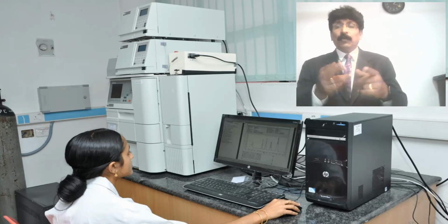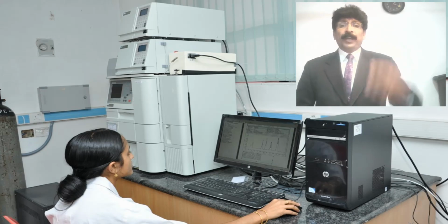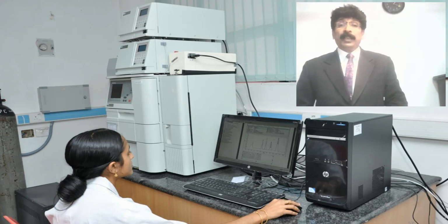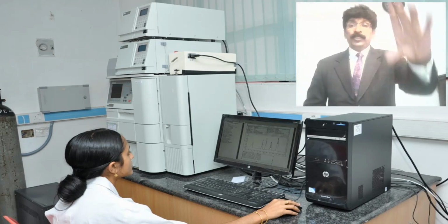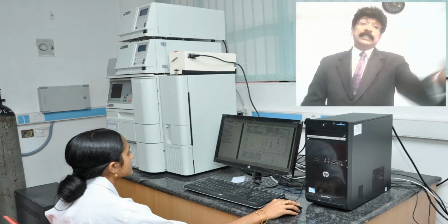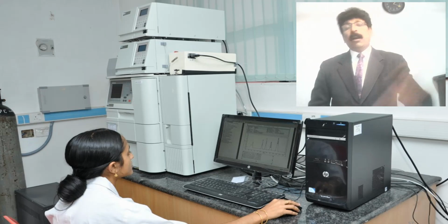This is the original instrument. The madam is working on it with a computer attached. We can see there are various compartments where the degassing, pump, mixing of solvent system are done, and the solvent system usually will be kept in a different place, on the top, which is not to be seen in this picture. You can keep it in that side, if it is an isocratic or gradient.